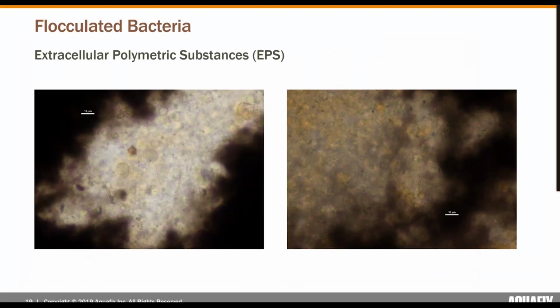And so now that we know a little bit more about the floc formation process and the bacterial growth process, I want to move into some of the more analytical observations that Aquafix looks at when analyzing floc structure within a wastewater sample that we receive.